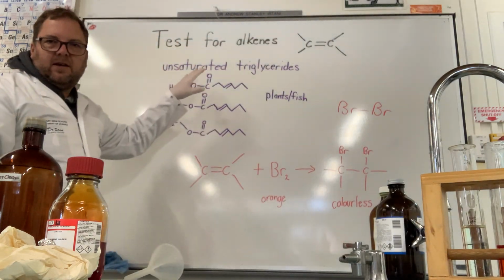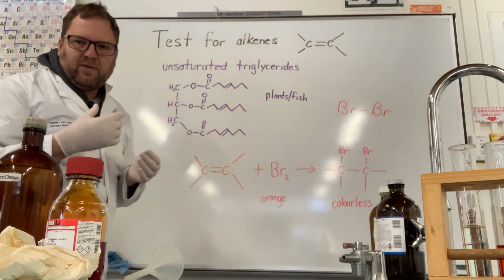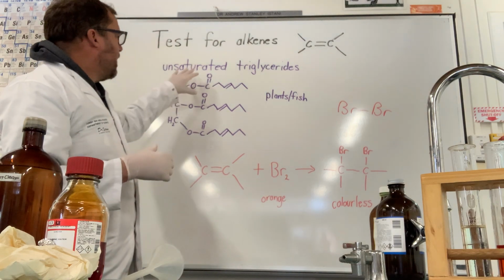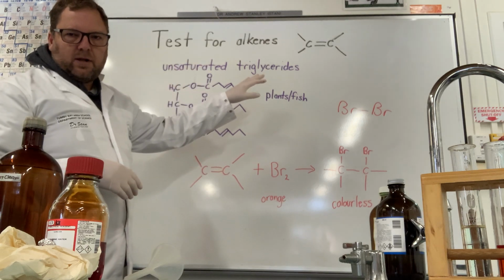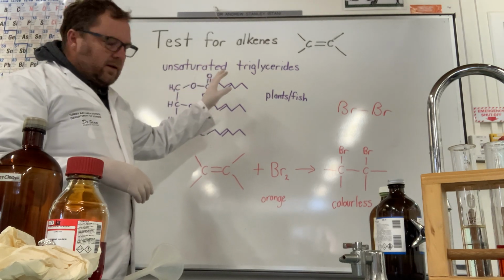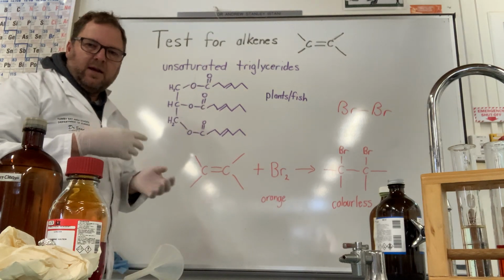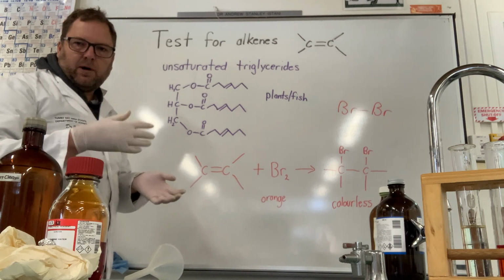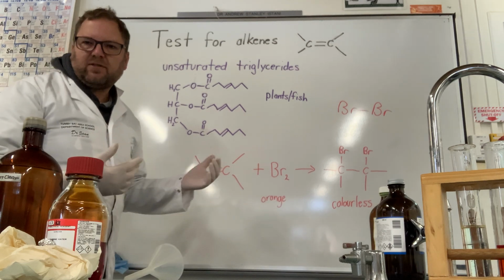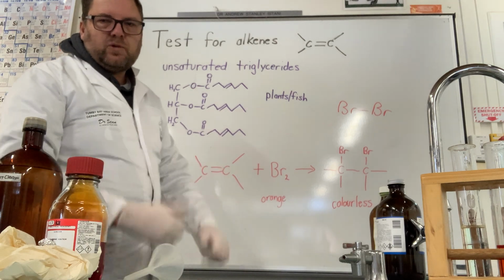So, that is our test for alkenes, but we've also used that as a chance to look again at triglycerides, saturated and unsaturated triglycerides, and also we've been able to cover a little bit on the idea of solubility with things dissolving in polar or non-polar solvents, depending on whether they are polar or non-polar, so likes dissolving likes and that sort of stuff. So, good stuff. Cheers.